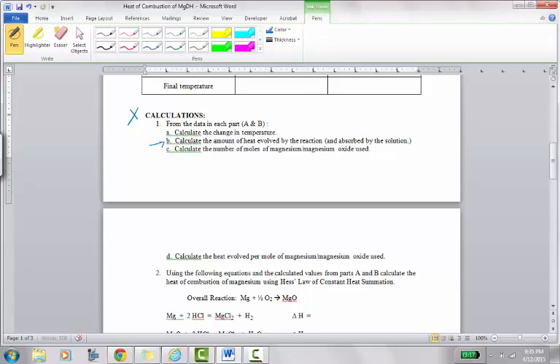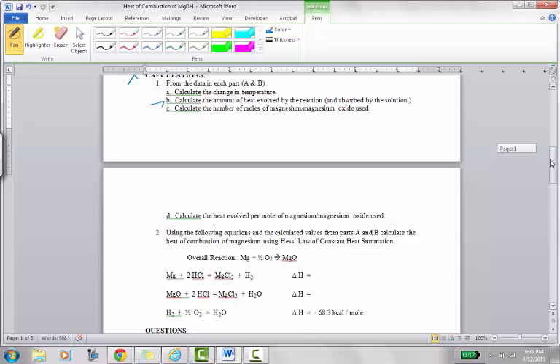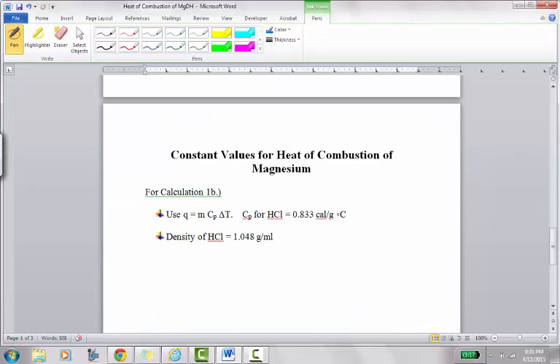So how are we going to actually find out how much heat has escaped as a result of that reaction? Heat, a value we once called Q. There's an equation we once used. Do you remember what it is? If you're thinking Q equals mCp delta T, you're exactly right.